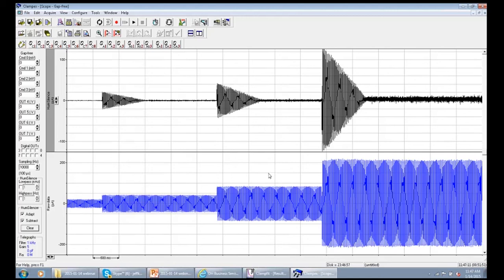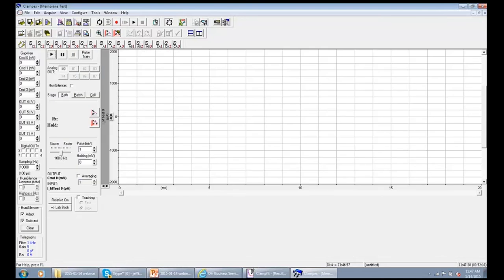The last demonstration I want to share is how the Hum Silencer behaves during episodic stimulation. Before that, let me briefly show the membrane test — in the membrane test dialog you can see the Hum Silencer checkbox, and you check it to use the Hum Silencer there as well.